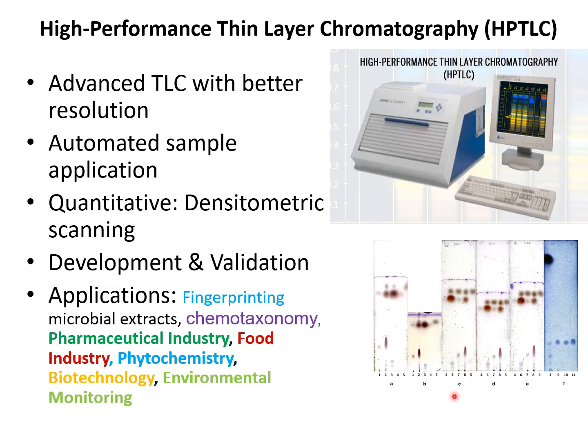Take, for example, microorganism C compared to microorganism E. These microorganisms are the same because their fingerprint is the same, meaning that they belong to the same strain. However, the microorganisms in D, B, and A are different because they produce different fingerprints.